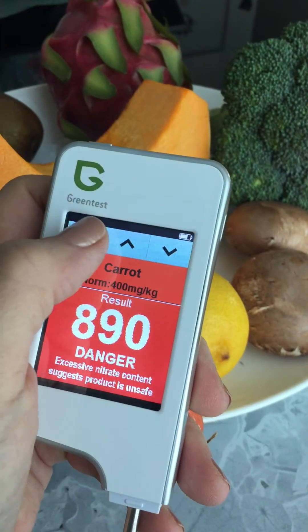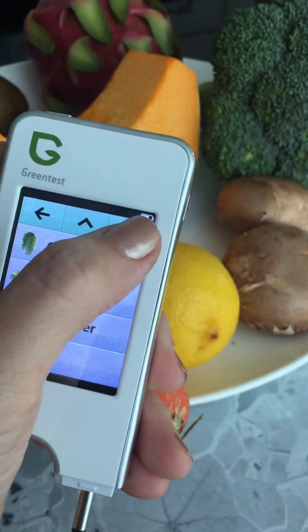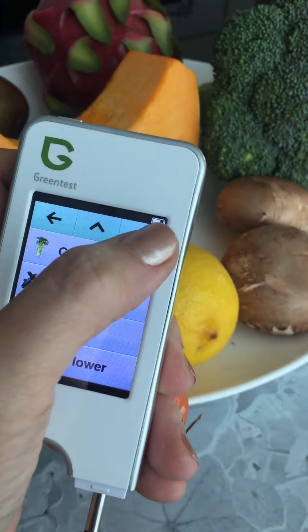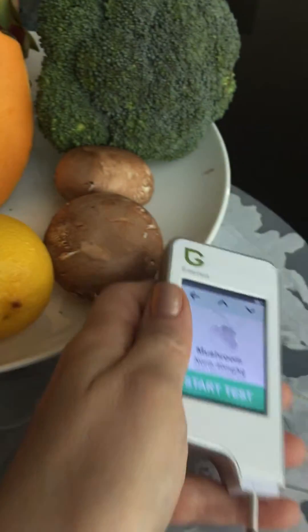Let's move on to the next vegetable. I'm cleaning the probe — you need to clean it after every test. Let's go back to the screen and test mushrooms now.